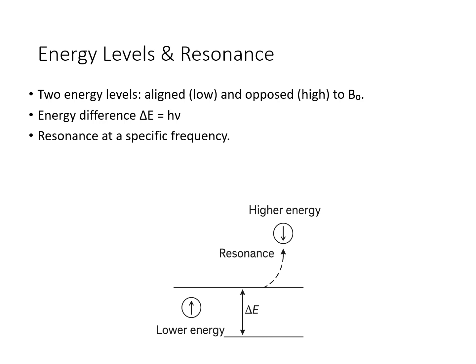Now we will discuss the energy levels and resonance. In the magnetic field, a nucleus has two possible energy states, a lower energy state and a higher energy state. The energy difference between these states determines the radio frequency.